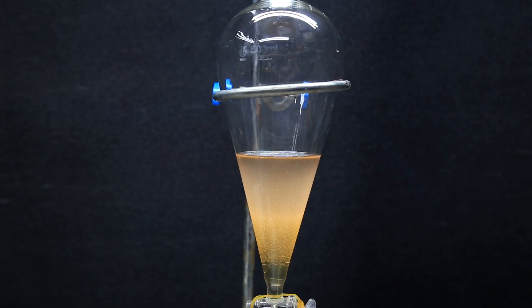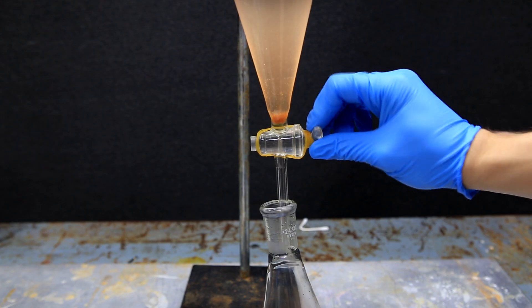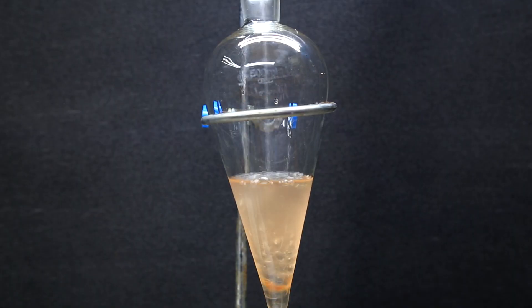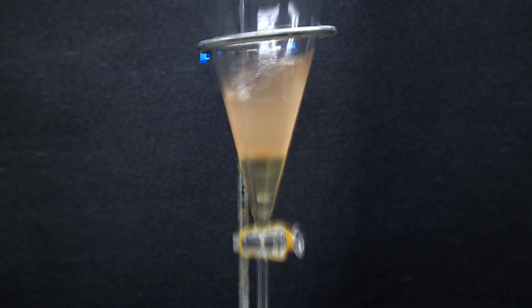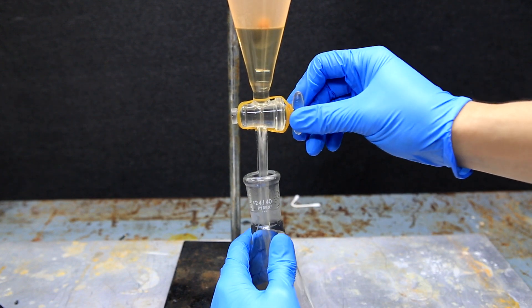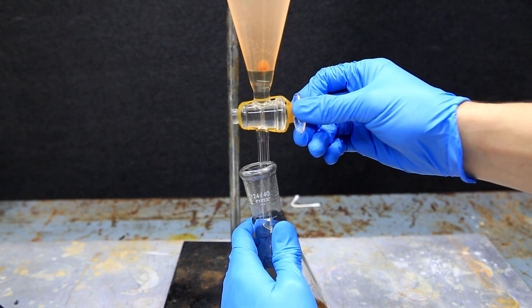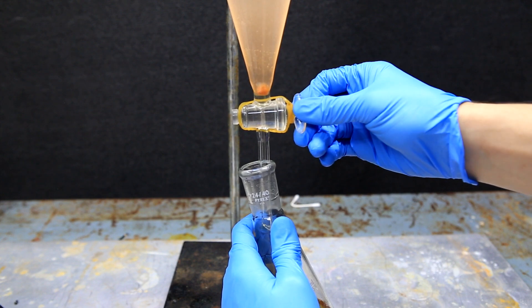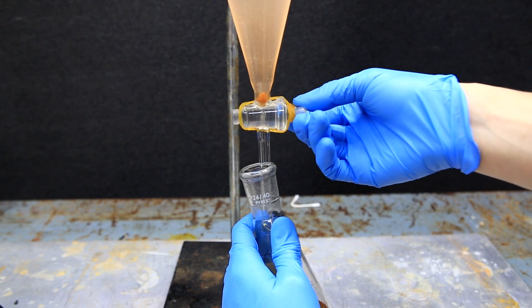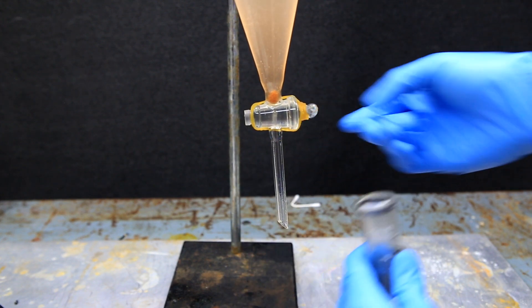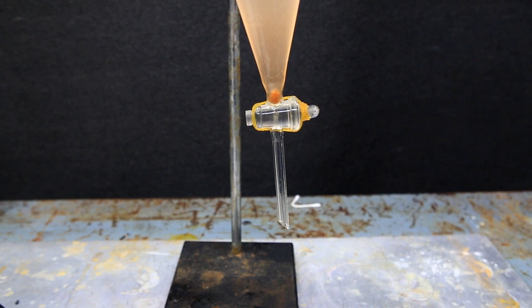The extraction was repeated two more times using 25 milliliters of dichloromethane each time. On the last washing, you'll notice that the DCM layer is only faintly yellow and the water layer is faintly pink. This is good because it indicates that the vast majority of the phenylhydrazine freebase has been extracted out.